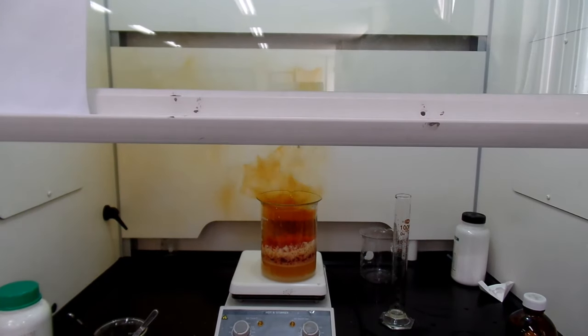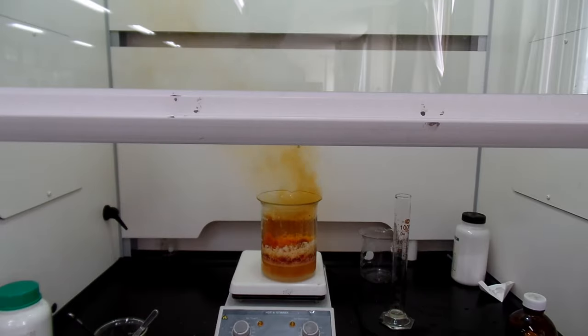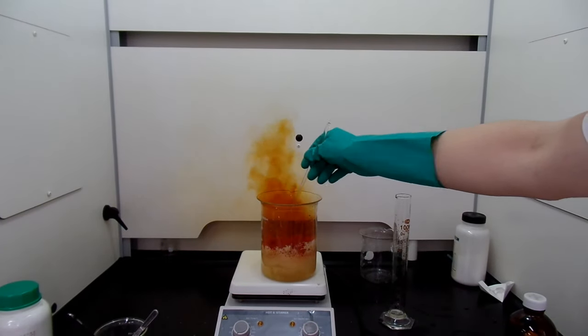I moved everything into the fume hood because nitrogen dioxide is no joke when it comes to toxicity. Nitrogen dioxide is extremely poisonous. I accidentally smelled it and it actually had an odor of boiled egg, except it's extremely potent. I quickly wore my respirator for obvious safety reasons.